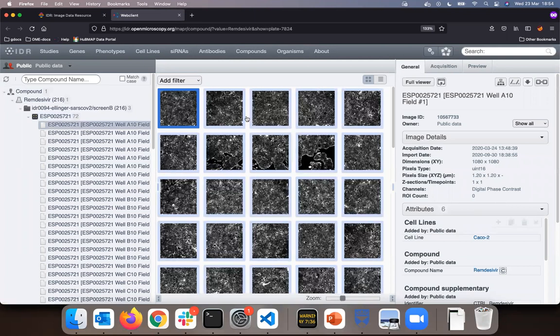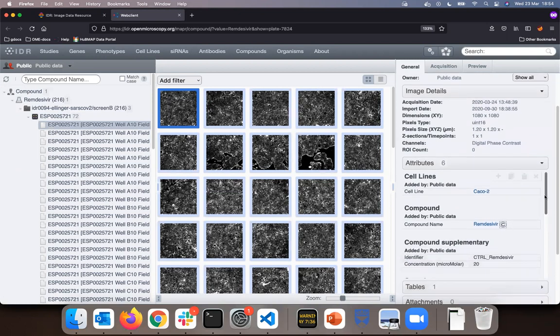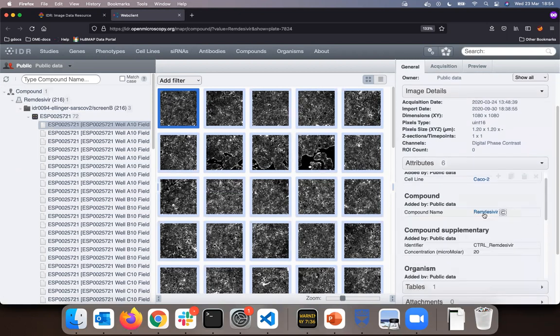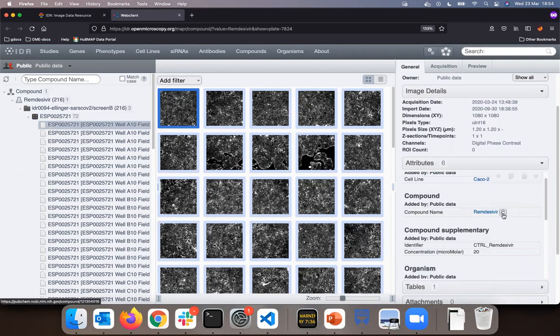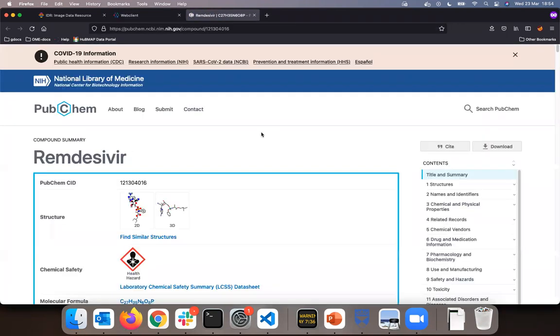The images are showing monolayer of human cells. On the right hand side I have the most important metadata associated with that image, such as in the compound section, the Remdesivir. The icon will lead me to an external PubChem database where I can read more about Remdesivir.